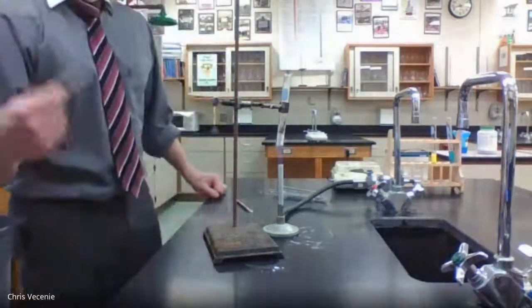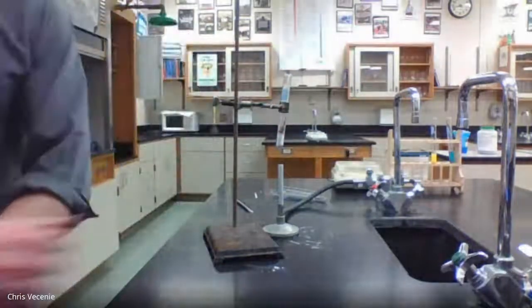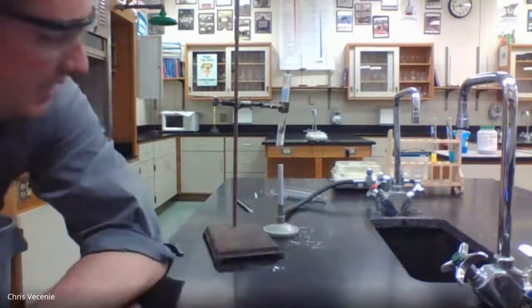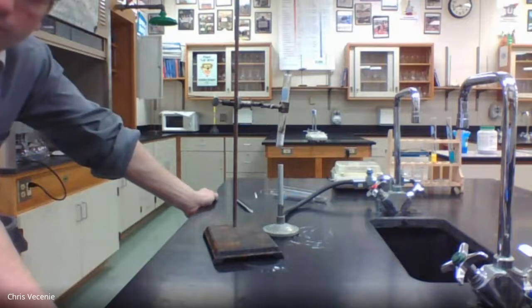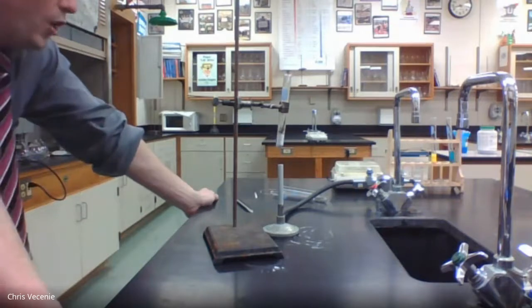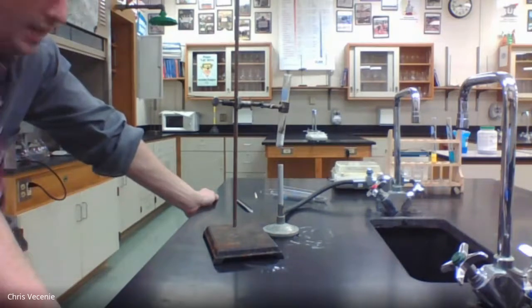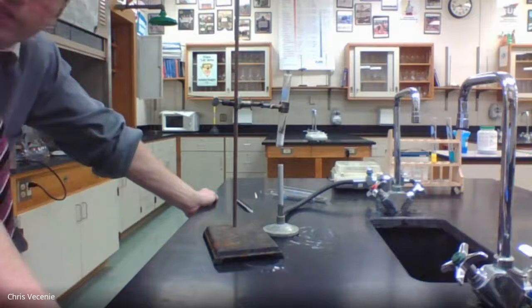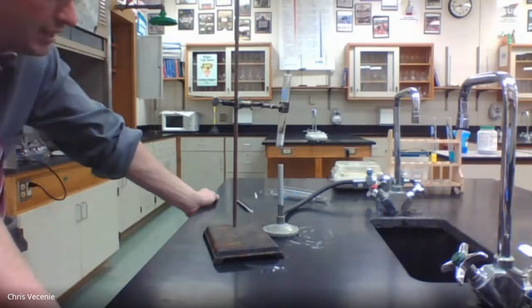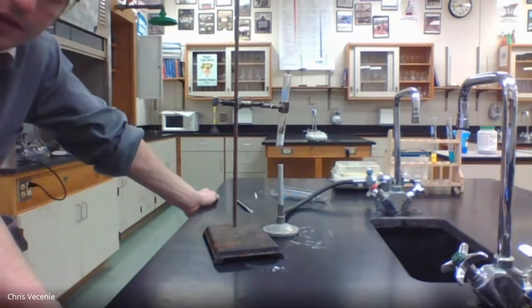So your observation is that it keeps extinguishing the lit splint. I know that's nothing exciting, but there's a good reason for that. If you take a look at the products of reaction 3, hopefully you're going to see that carbon dioxide is getting produced, and hopefully you know that carbon dioxide gobbles up oxygen and it won't let the fire keep burning. So it's a confirmation that we think the reaction that we predicted is what's happening. I just detected one of my 2 products.